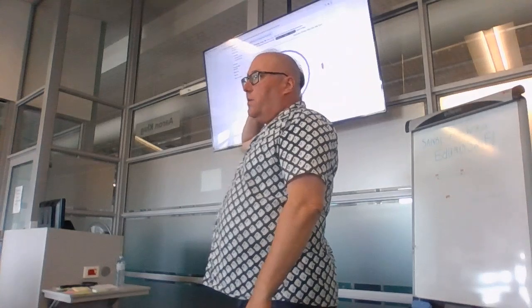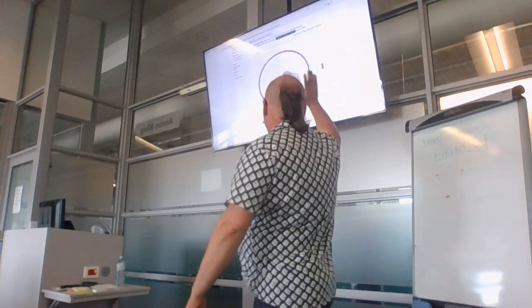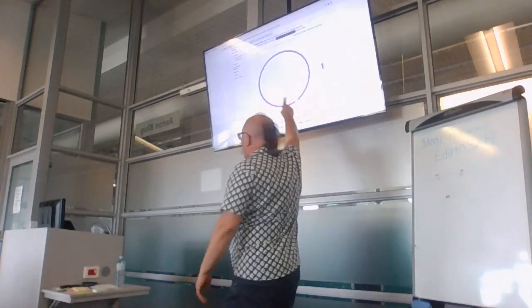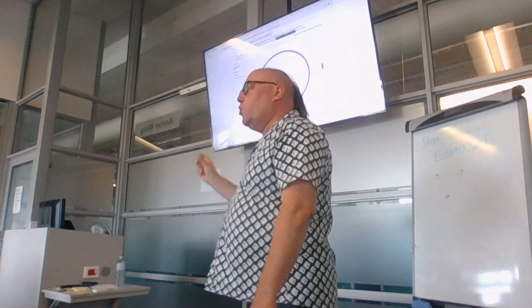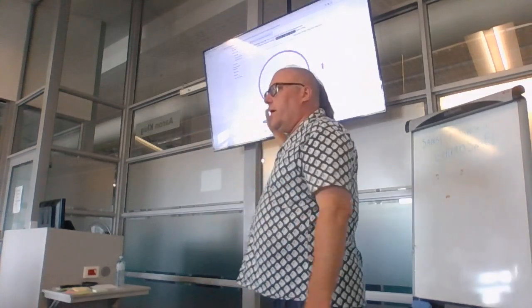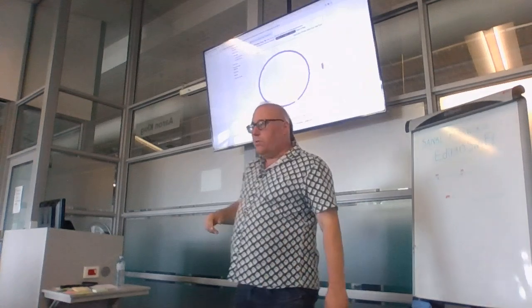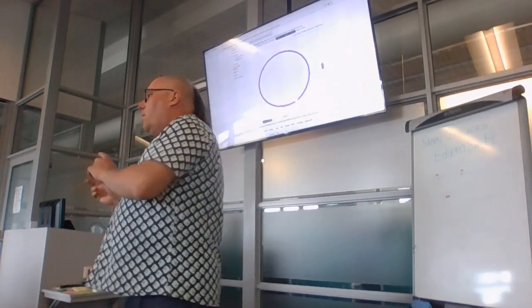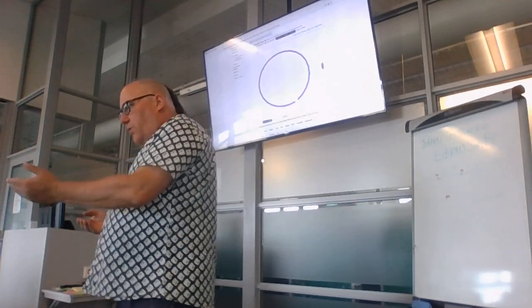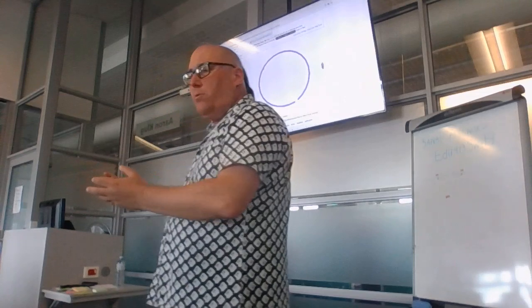He's publishing his results, and his conclusion is that if you've got nanopore and Illumina, you can use the Illumina to correct the individual errors within your nanopore assembly. That's a process called polishing, okay? But of course that means you must have both sequenced from the same isolate, with Illumina and with nanopore, okay?